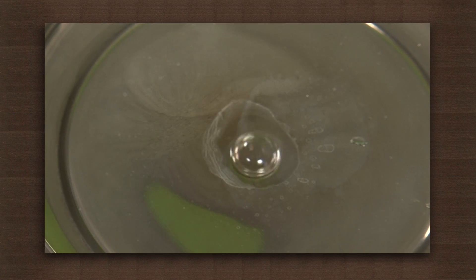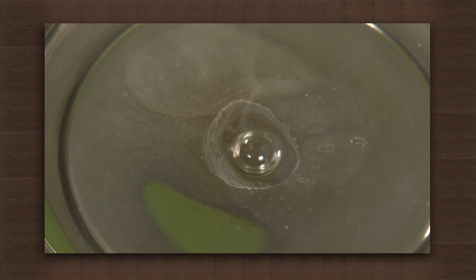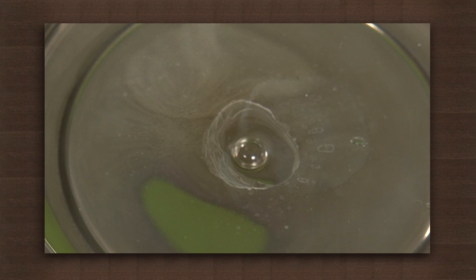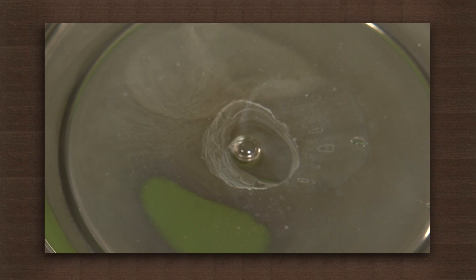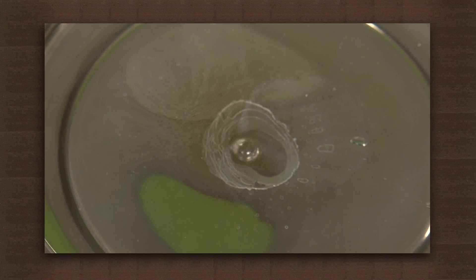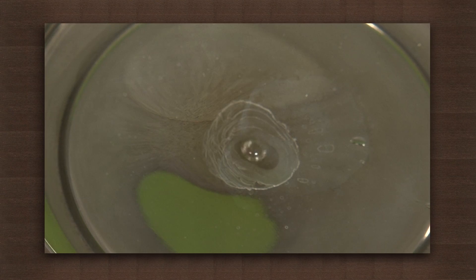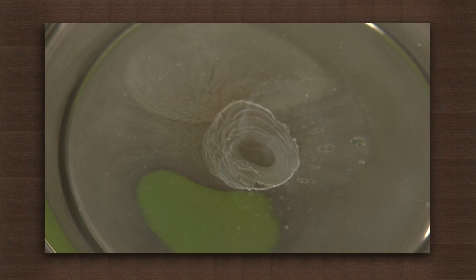Which water sample left behind the most residue? In this case, it is salt water. Thus, the amount of dissolved salt is more in salt water and least in tap water.